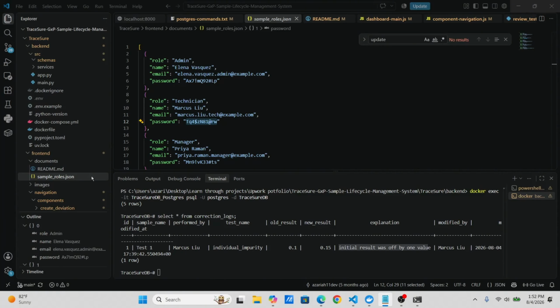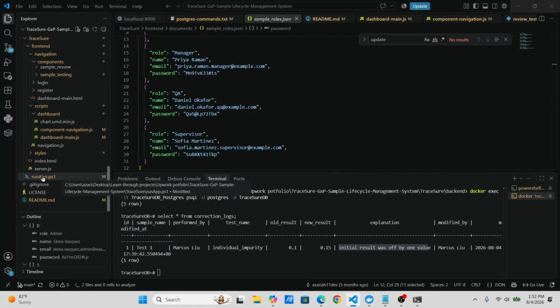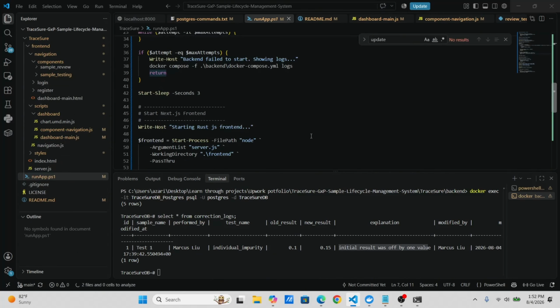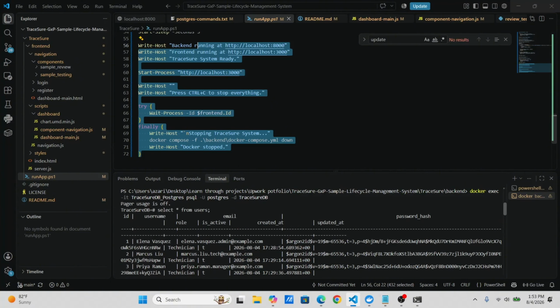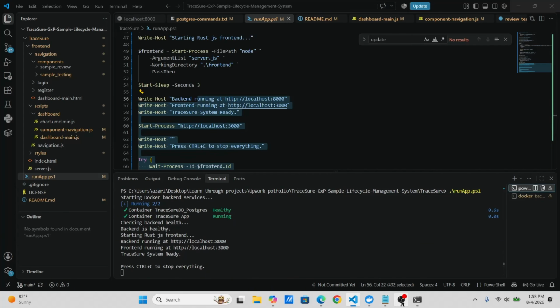This one, compared to the other projects, isn't really setup heavy. All you need is Docker set up correctly, and then you just need to change this if you don't use Windows. If you don't use Windows, you just need to change the run script. And I think you might also have to look up the run command, the terminal command, for non-Windows. But once you do that, the setup once again is super, super easy.